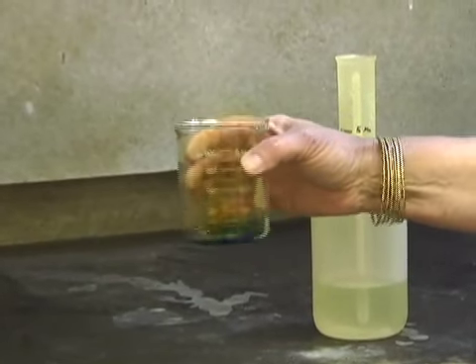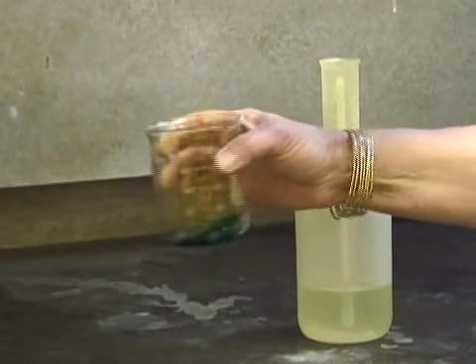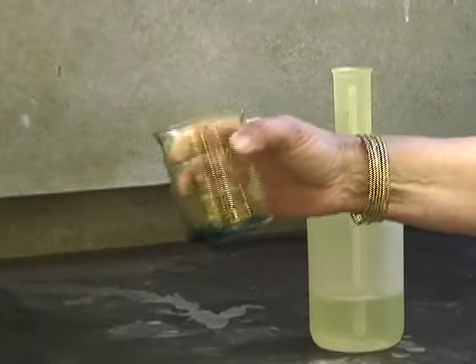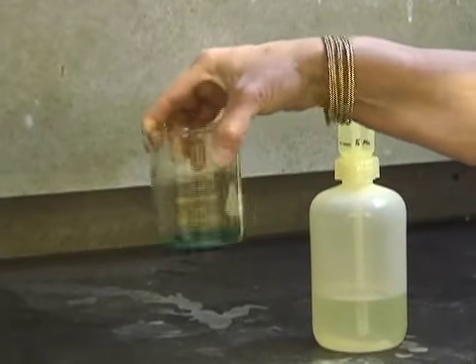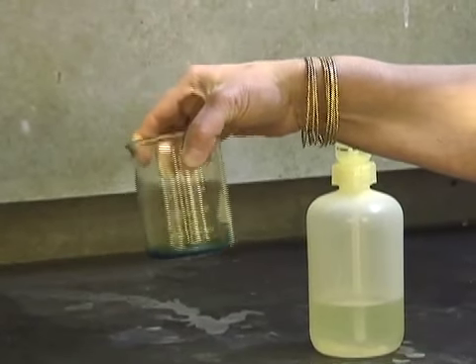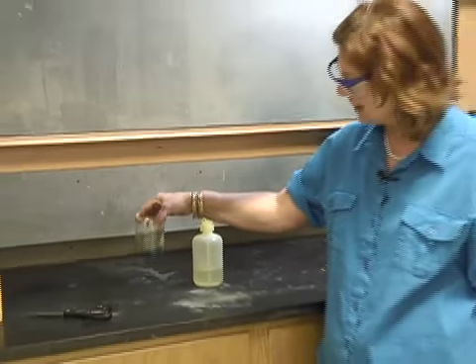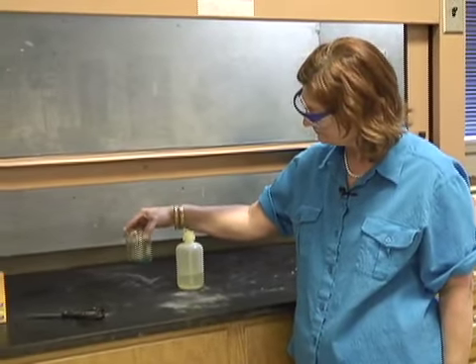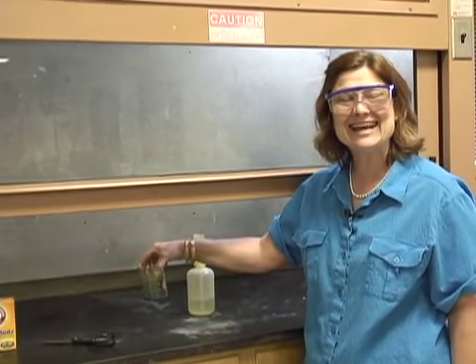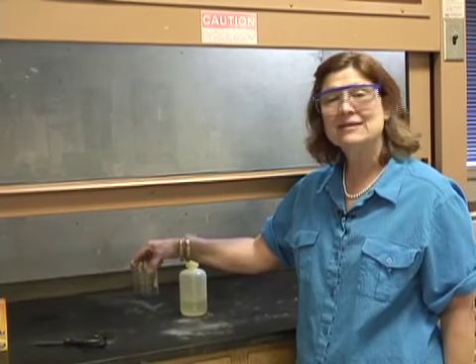I need to make sure that all of that brown gas has come off. The color of the liquid changes from green, and then it's going to get a very beautiful royal blue. Before I remove it from the hood, I need to make sure that all of that brown gas has come off, and that is NO2, in our very first reaction. Wasn't that exciting? That's so wonderful. Now we're going to take this and add some other things to it, and I will see you at the lab station.